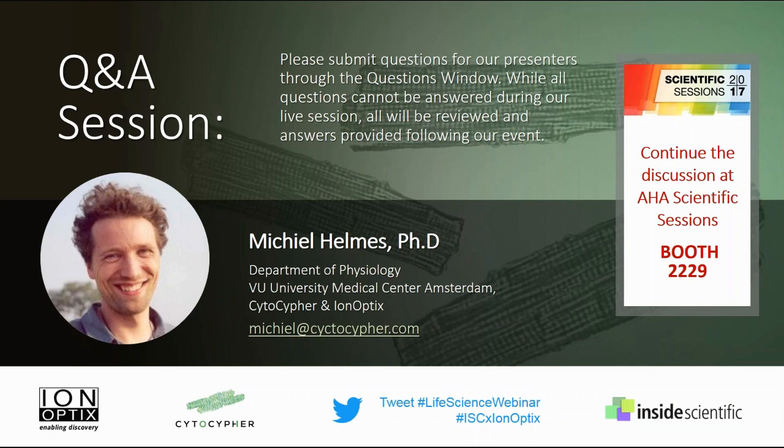But then if you want to test for cardiac toxicity, the animal model is at least as important as the actual measurements themselves. We can detect arrhythmias, but the model has to be correct. Right. Very good. Joe, any additional thoughts on that one? Nope, Michael said it all. Perfect. Okay.